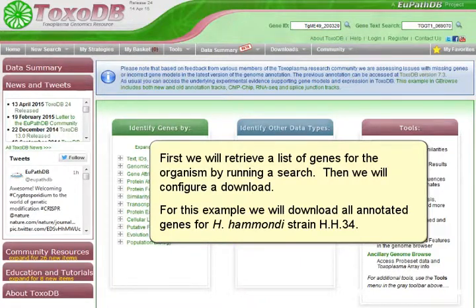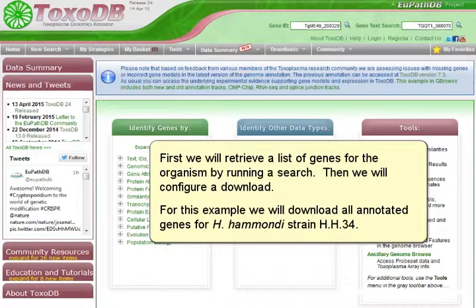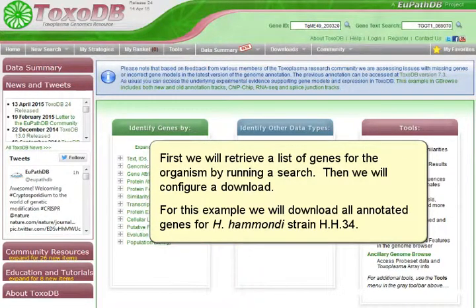First, we will retrieve a list of genes for an organism by running a search. Then, we will configure a download. For this example, we will download all annotated genes for Hammondia hammondi strain HH34.